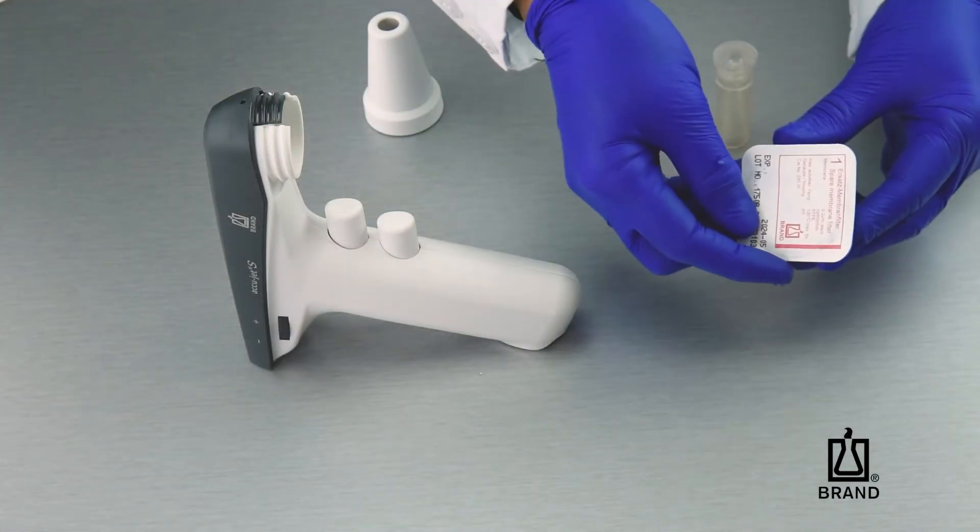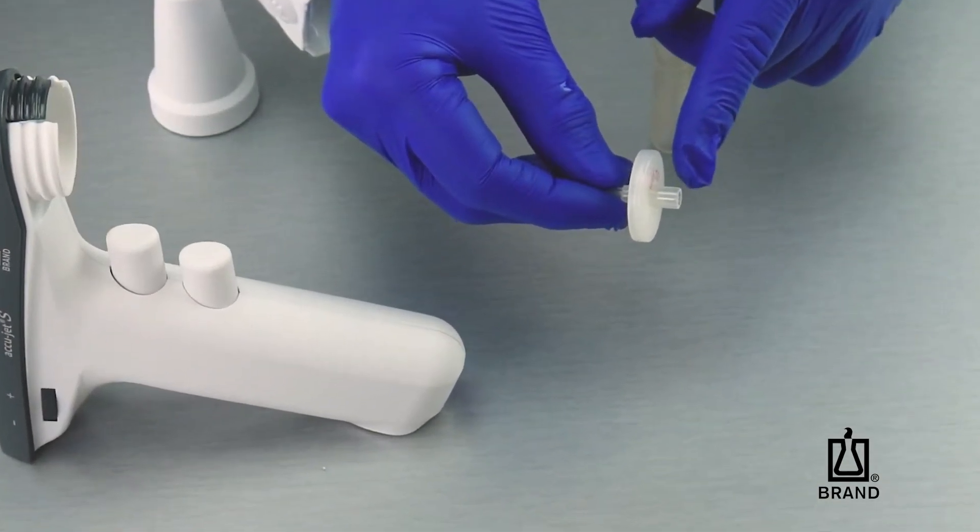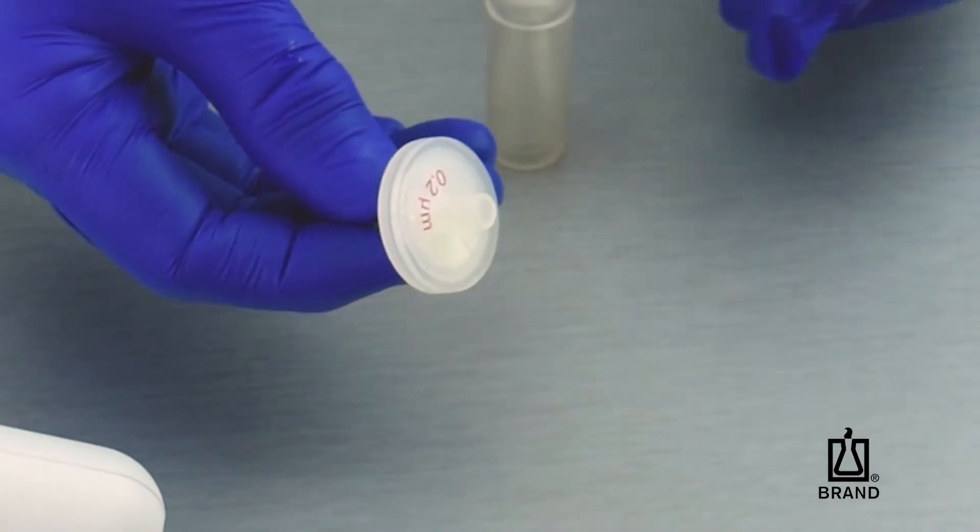Remove a new filter from the packaging. With the wide connection, insert it into the top of the silicone adapter.